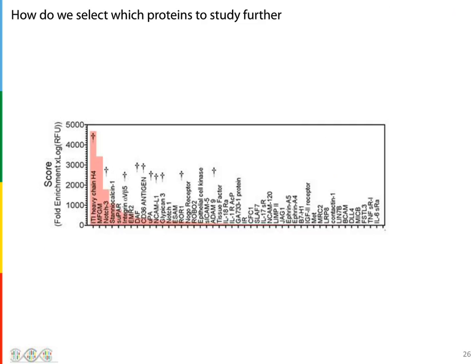If you do that and you read from the list to see what's there, we see very high up in our ranked list this MFGE8 molecule, which I spoke about before. There's DAF, decay accelerating factor. We have CD36, and we have some integrins. So these things are all well known to be associated with vesicles. To see those things come up in this ranked list was again very reassuring.